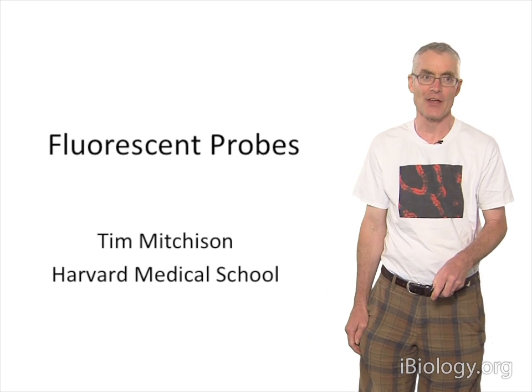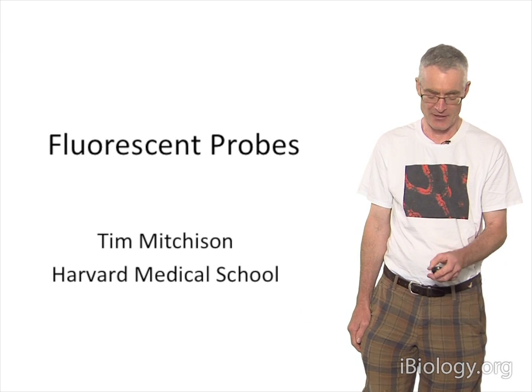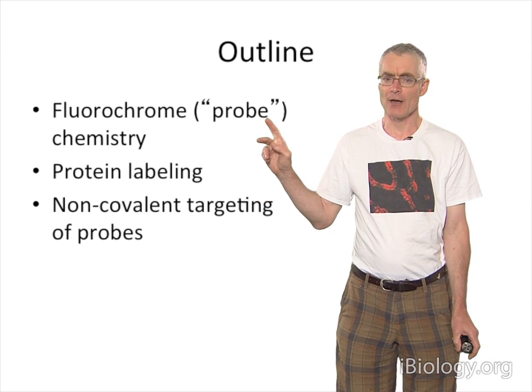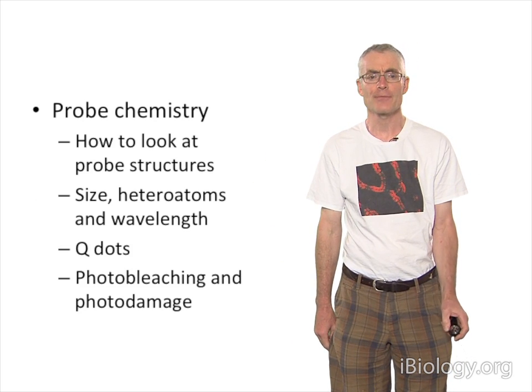One of the things I'd like to give you guys is some appreciation for these beautiful molecules and their properties, and particularly how their chemistry gives rise to their properties. But for those of you who aren't chemists, don't worry, I'm going to try and make it as easy as possible. Okay, so the outline of this presentation, we're going to be talking about probe chemistry, and then we'll talk about protein labeling, and then finally non-covalent targeting of probes.